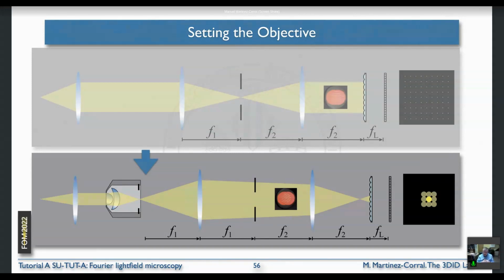Okay, and therefore we will have, let's say, many checkpoints. When it is in the good position, 2 checkpoints in the good position, then we have that the shear plate tells us that this is a parallel beam. Okay, and here we have only a single, sharp image of the field stop.